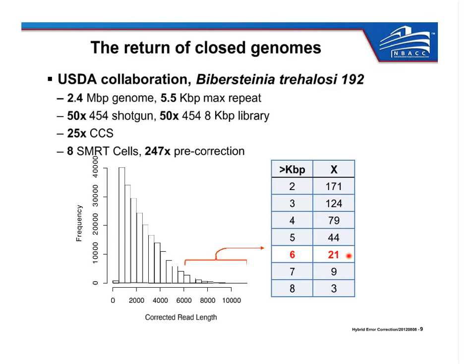And the choice of Celera Assembler, obviously, as I mentioned in your bios, you have some great familiarity with that program, but have you sort of empirically decided that that is the best program to use in this approach? That choice was primarily geared because we had experience with it, and so it was easiest to get that up and running the quickest. As I mentioned when I was presenting my slides, we've done some experimentation with using additional assemblers on the corrected reads.